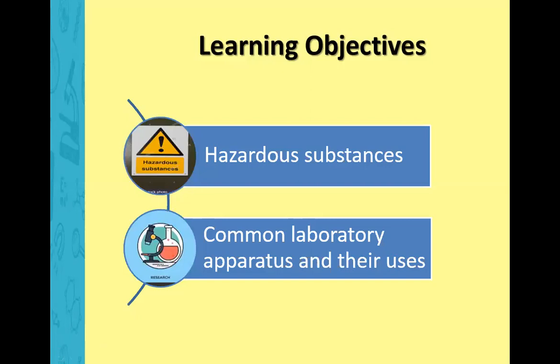Today we will learn about the hazardous substances and the common laboratory apparatus and their uses.